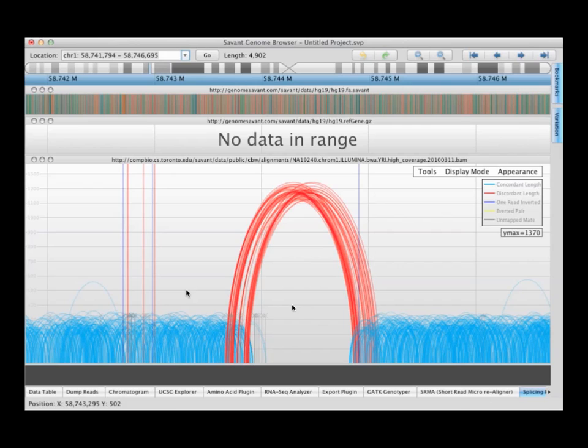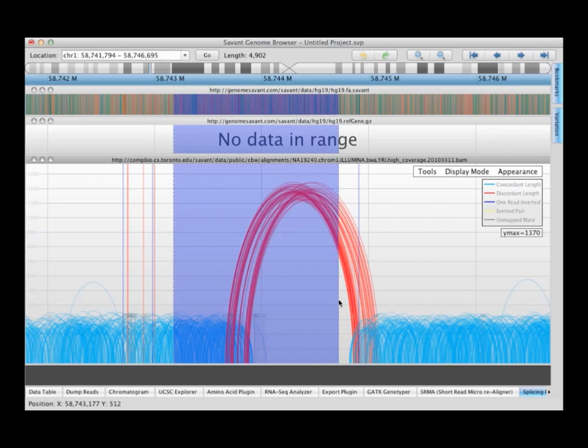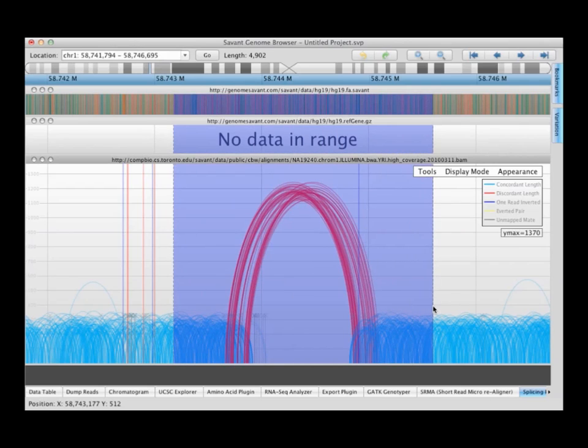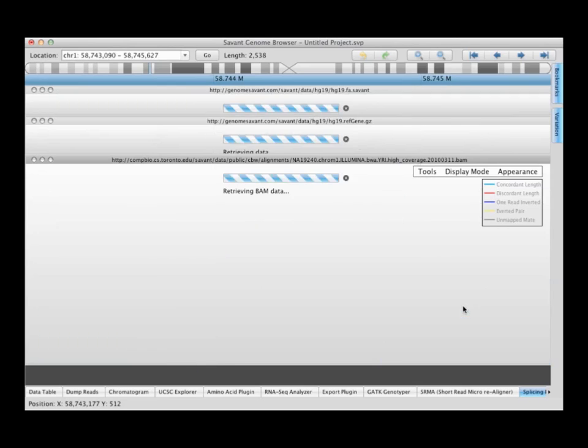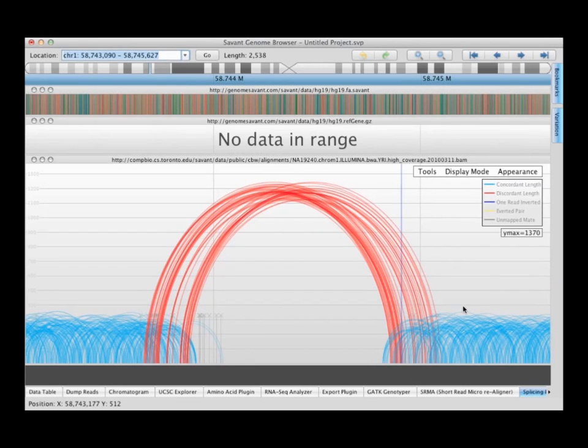Now we're going to look at the corresponding arc visualization of those two events. This is the homozygous event we were just looking at. Here we have a pretty clear set of discordant mate pairs. Again, there's no information coming from the center, so this is support for the homozygous. And we can identify the breakpoints here. Any questions?